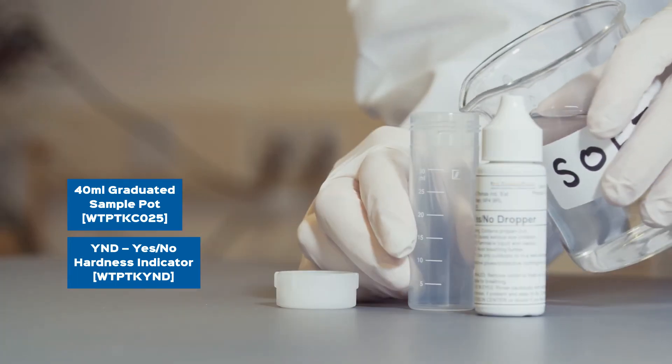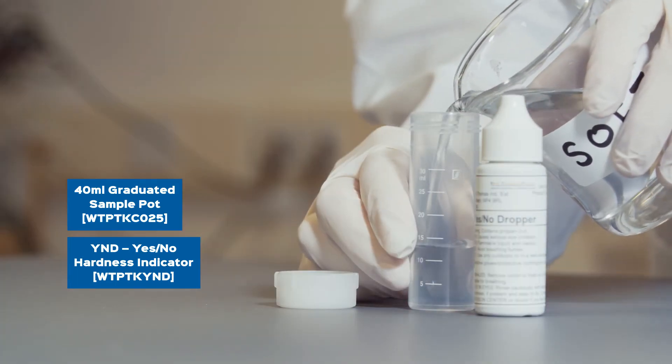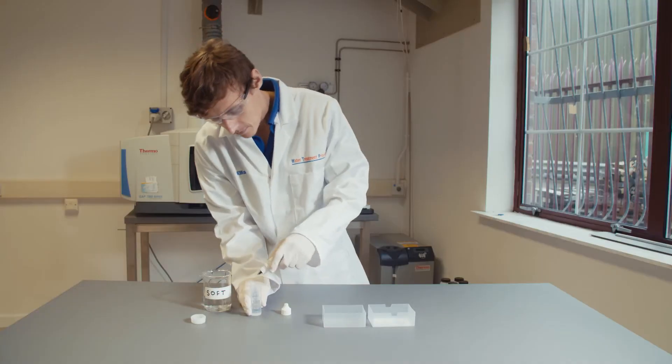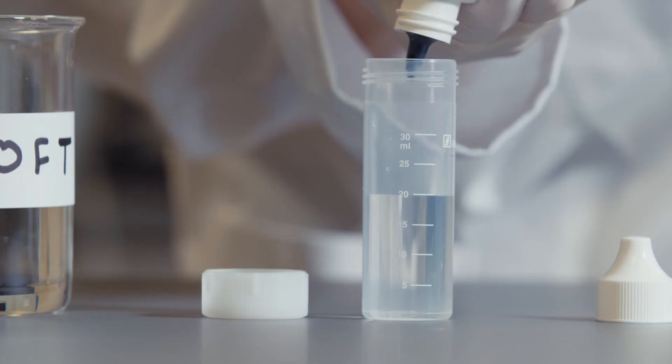Transfer 20 milliliters of your test sample to the sample pot provided. Next add five drops of yes no hardness indicator.